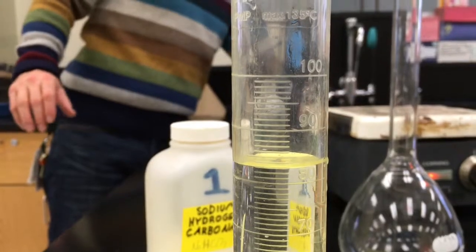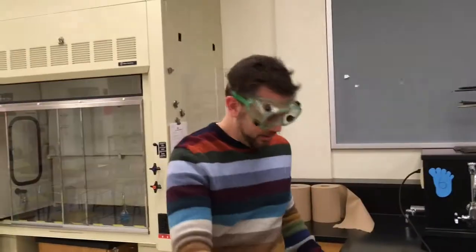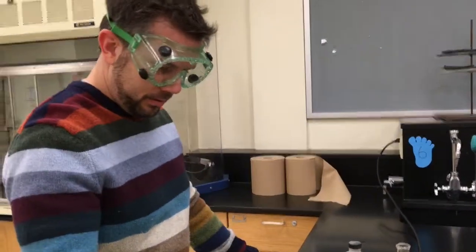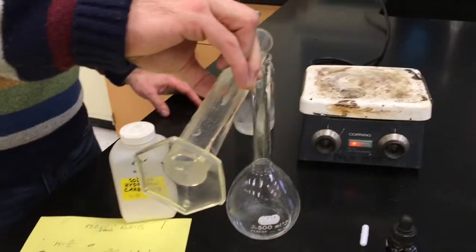I'll rinse my hands off here. That is very nice, Mr. Scott. Is it pretty close? Well, it's exactly 83. We're going to say it's exactly 83.3 when I estimate. Alright. Good job. So now I'm going to pour this into my 500 milliliter flask.